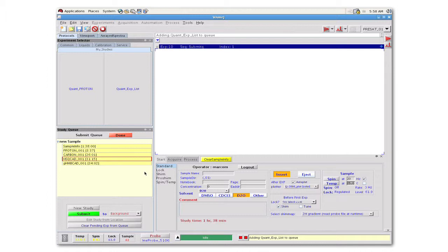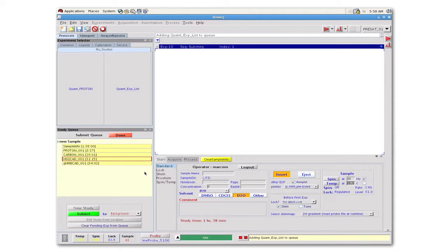We have seen how the VNMRJ interface uses the idea of a study clone to customize the interface to suit a particular user's tastes and desires. This feature is very powerful and allows every user to make the system as efficient as possible, accommodating individual research requirements.